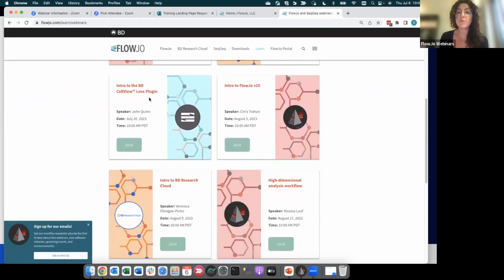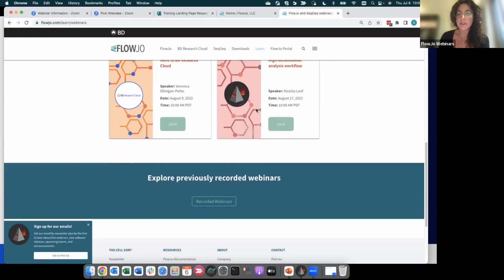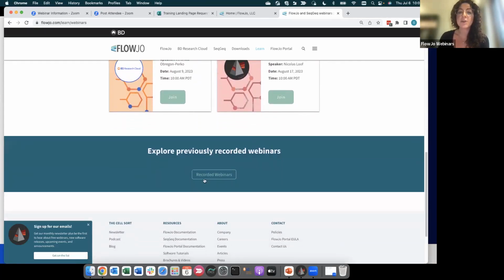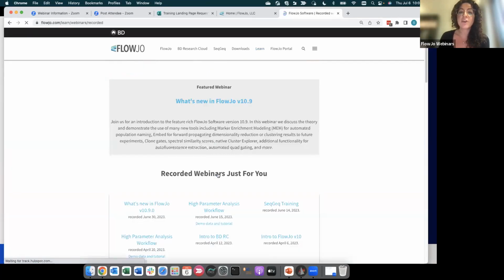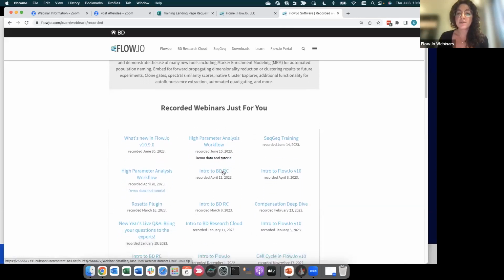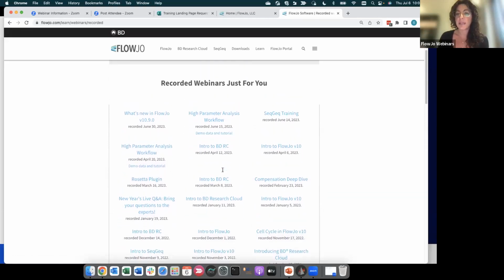We have monthly webinars for basic and advanced features of FlowJo, so you can sign up and join live as this morning. Or if you miss any of these webinars, you can go all the way to the bottom of the page right here and find the recorded webinars. As with this one, all the webinars are recorded, so you can rewatch them anytime.